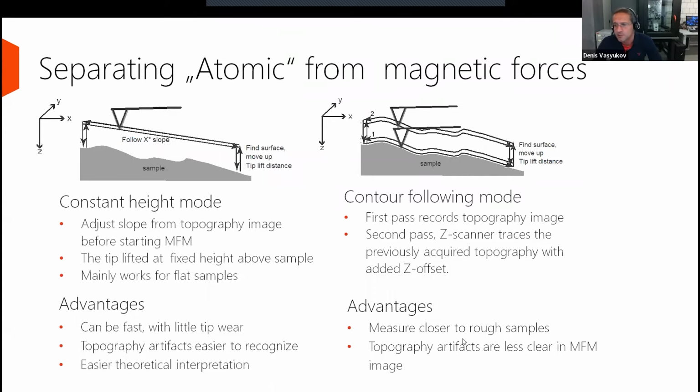The advantage is that if you measure rough samples, you get a better understanding and have fewer imaging artifacts. But yeah, it is slower, and you have a bit more tip wear. So today we will learn how to do these two different modes of measurement.